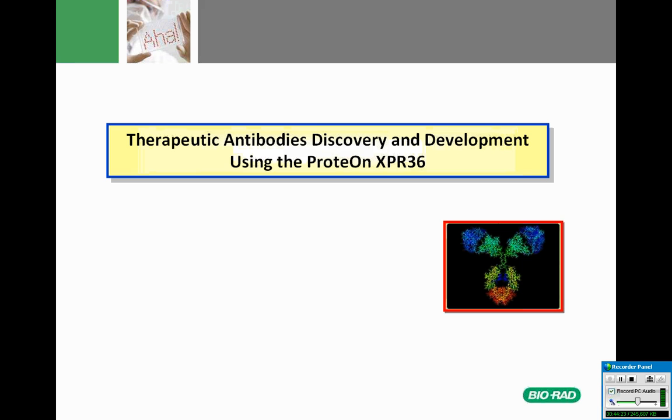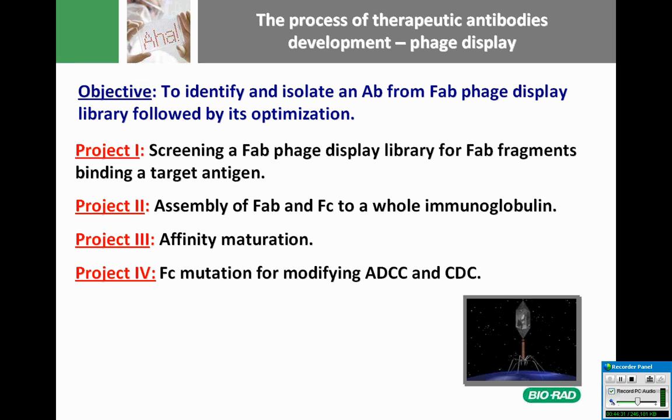The second example is the discovery and development of therapeutic antibodies using the ProteOn XPR36. And this is a long project that we did together with a small pharma company that is discovering and developing anti-cancer therapeutic antibodies.